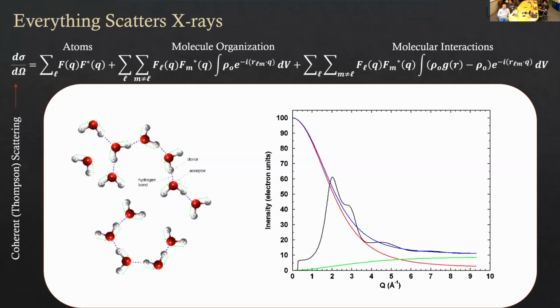And we're looking at the small angles. So we're looking just in this tiny, tiny region here where water is flat. And that's actually a useful definition of small angle X-ray scattering. Everything that's below the water ring would be what we were interested in. Really, small angle X-ray scattering comes from the small angle approximation, that sine theta equals theta, but in general, we're a little bit further than that when we're analyzing our data.